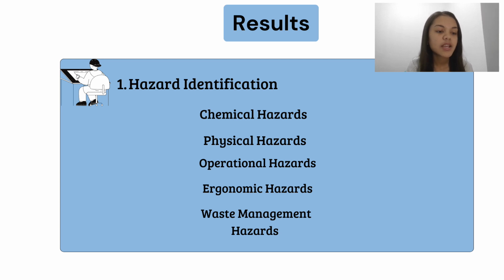And the third is the operational hazards. Misuse or a malfunction of equipment might result in harm or mistakes in the study. For the operational hazards, the source of the hazard is jar testing machines not operating correctly and inadequate calibration of measurement equipment. The control measures are frequent calibration and upkeep, create SOPs and clear instructions, and then perform inspections on equipment before usage.